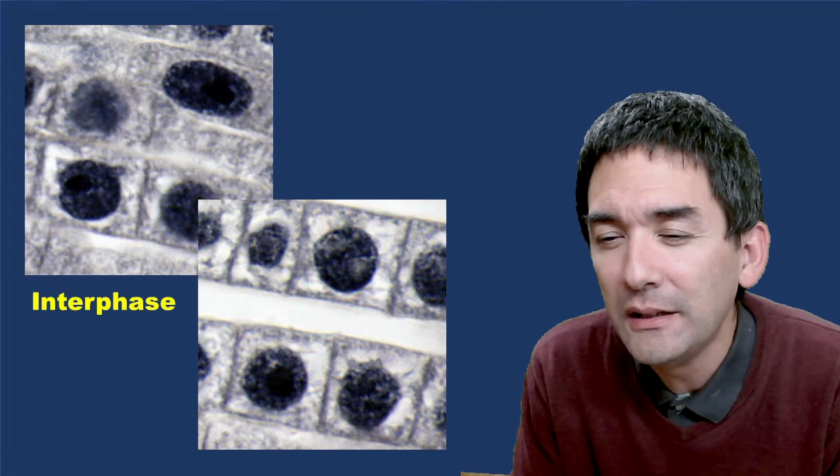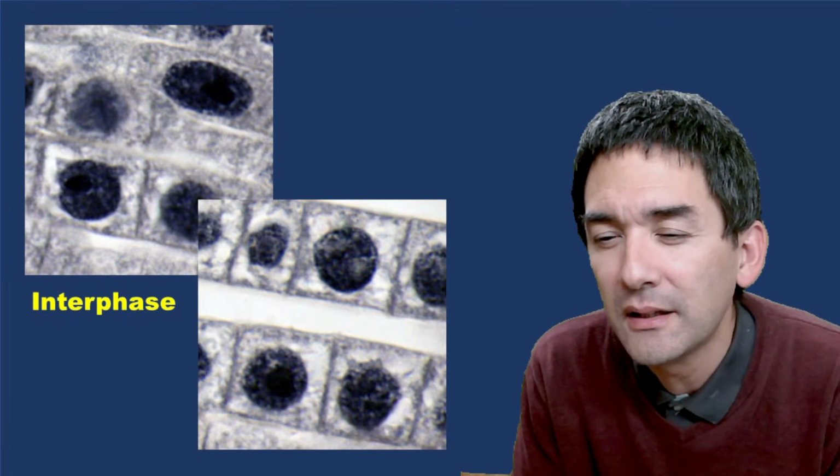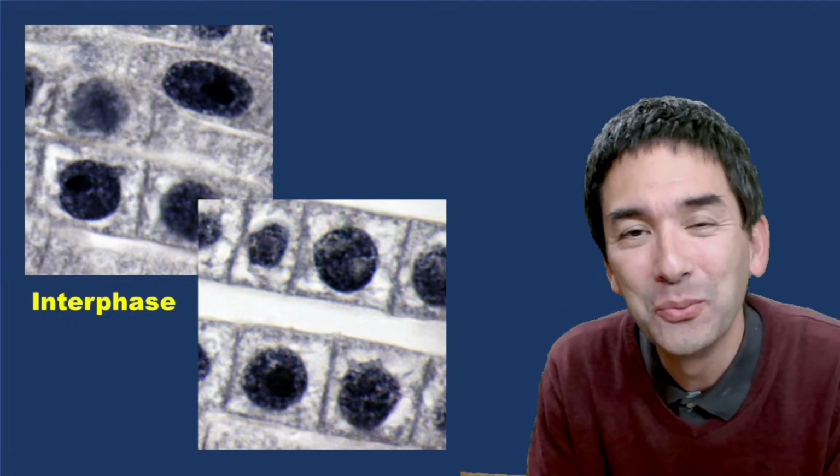Chromosomes are stored in the nucleus of the cell. Does the nucleus get destroyed? Well, that's a good one. Thank you very much.